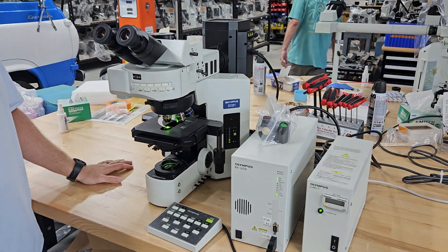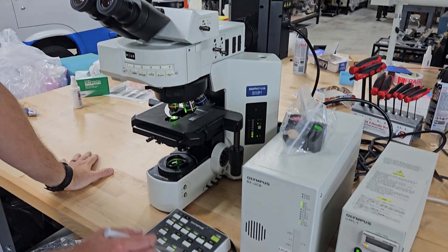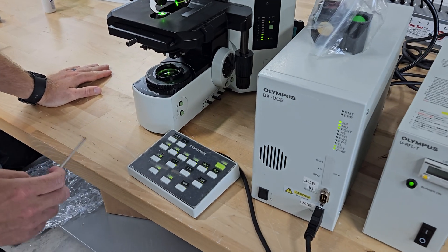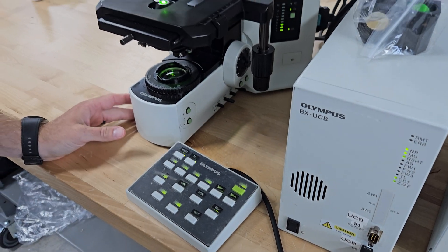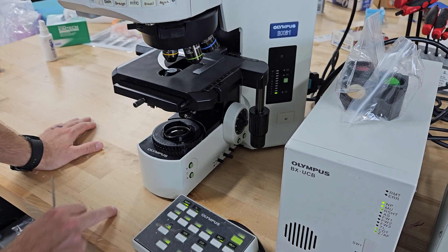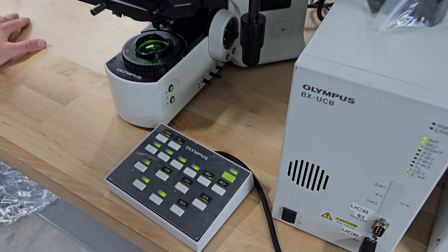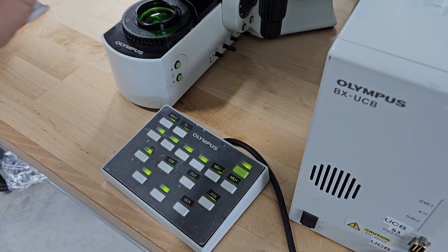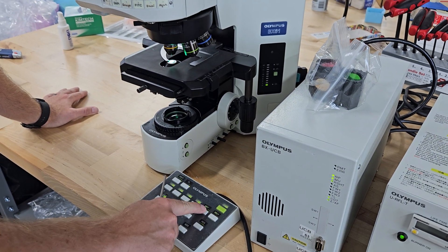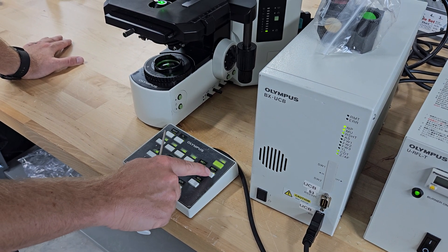First off, this keypad here is probably going to be the most confusing thing for people, and we're going to show you a few things. We have the fluorescent light on here. If you need to close the shutter, it's that button right there — it's marked. R shutter, reflected light shutter. To move the filter cubes, you have six cubes in this system. You have these buttons — if you want to go left, hit this button; if you want to go right, hit this button.